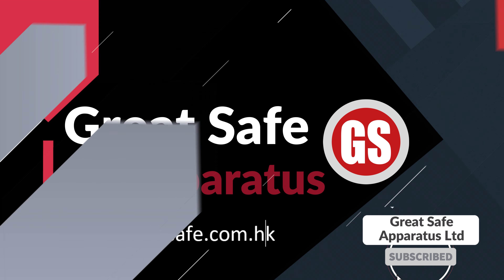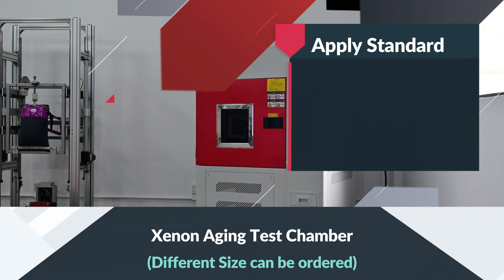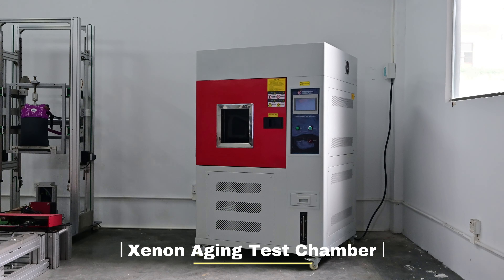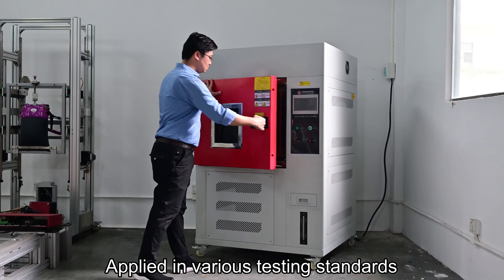Welcome to GreatSafe channel. In this channel, we will show you the testing machine operation. Now, I will show you the Xenon aging test chamber applied in various testing standards.